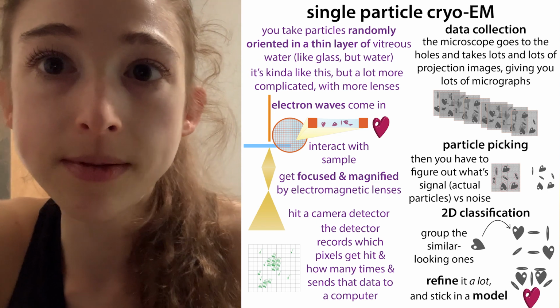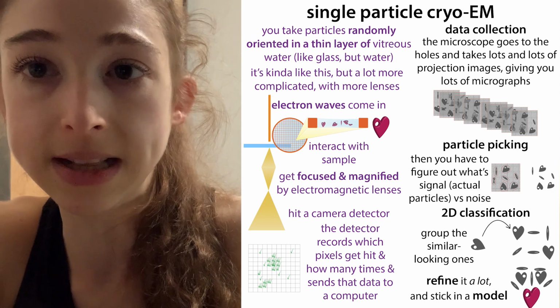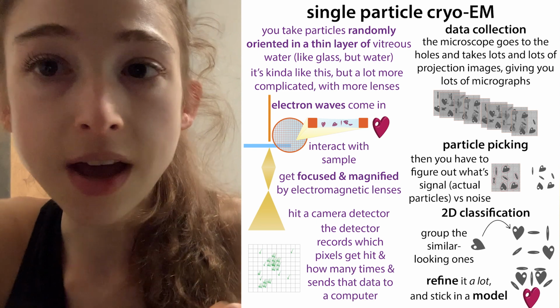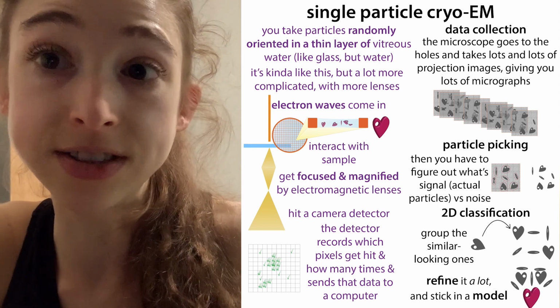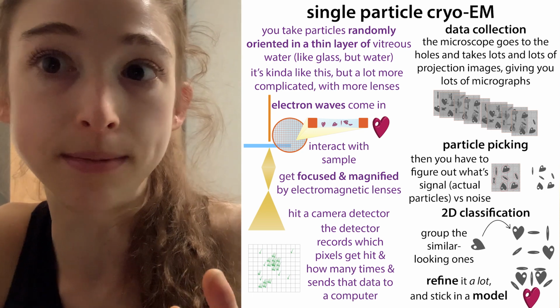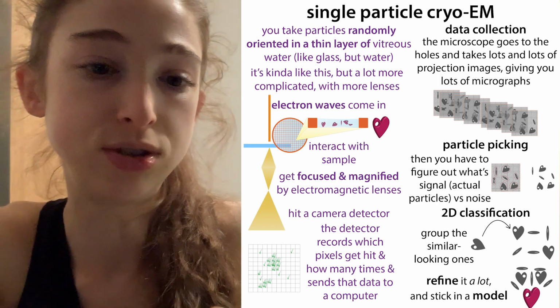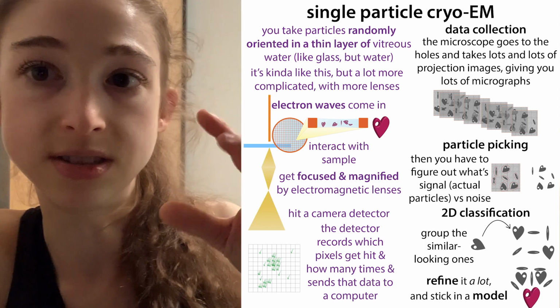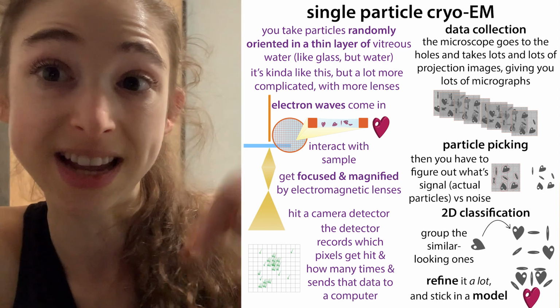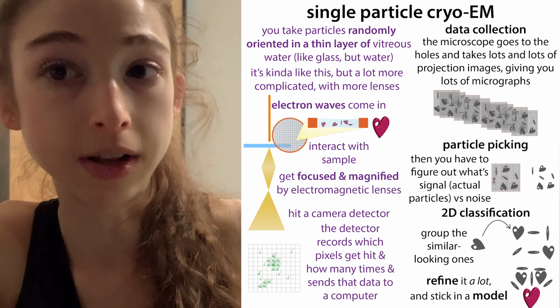And so one of the biggest hurdles to trying to get good resolution is that you're frying your samples, basically. So cryoprotecting them helps out. The other is being able to detect those electrons. And so there's direct detection of electrons. That was a huge game changer, being able to detect the electrons as opposed to having them on film that you then had to process. This is direct detection. It can actually detect the hitting of those electrons after they go through the sample. So cool stuff, and really helpful.